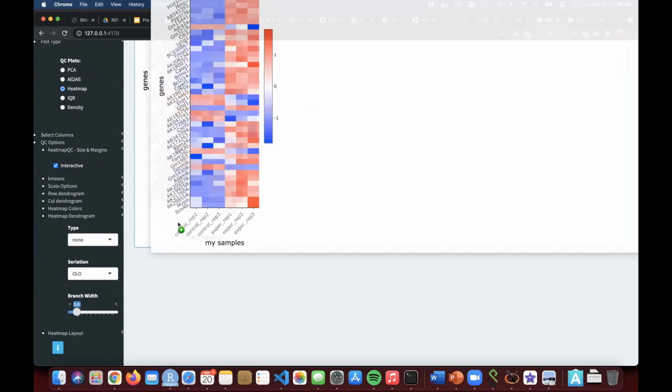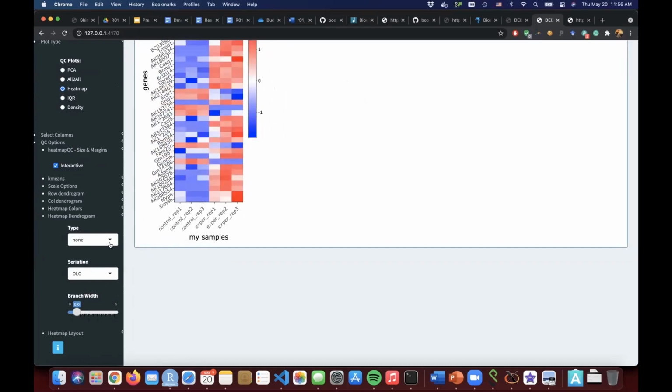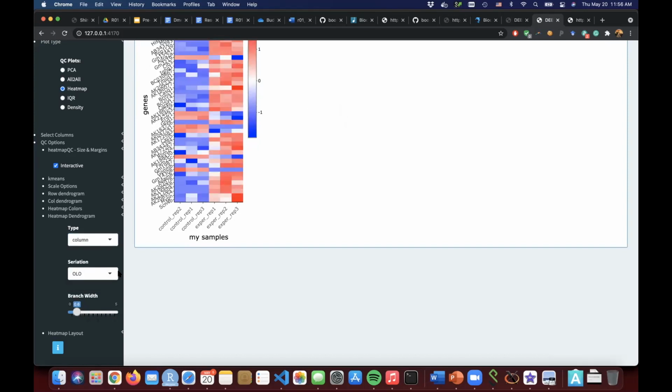I don't have that kind of functionality to use drag and drop to change the order here. But good question, maybe in the future we will have more functionalities, and we can think about how we can actually change the order.